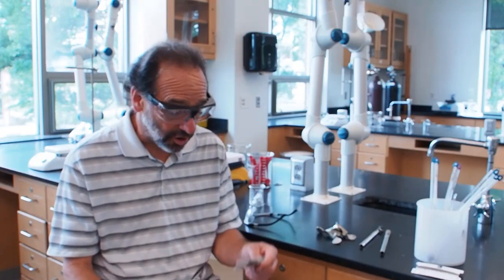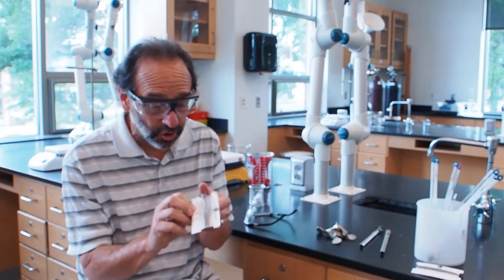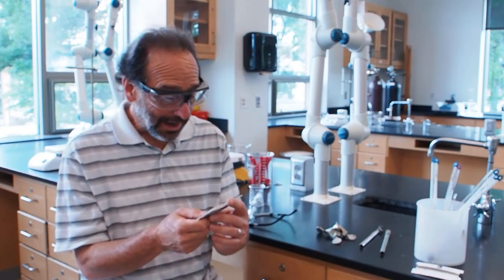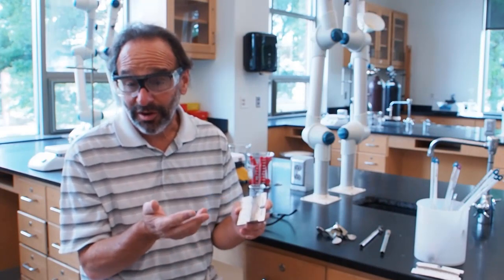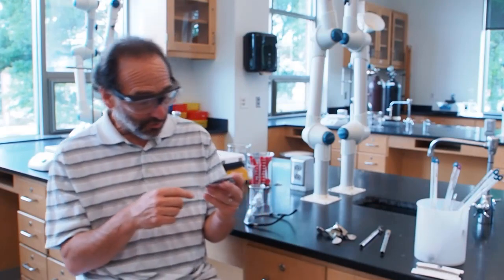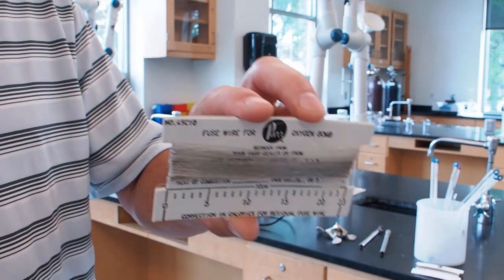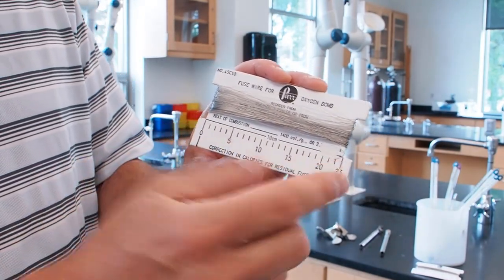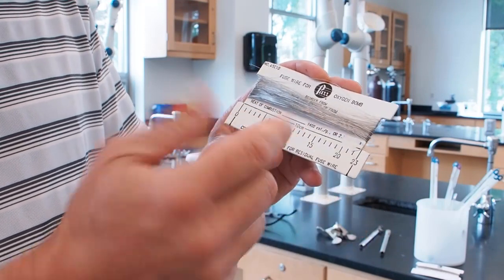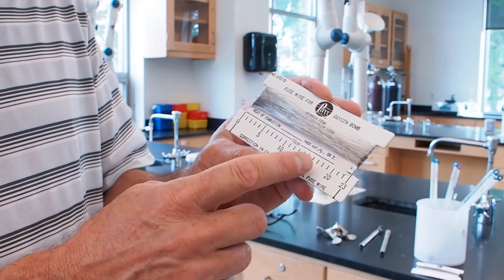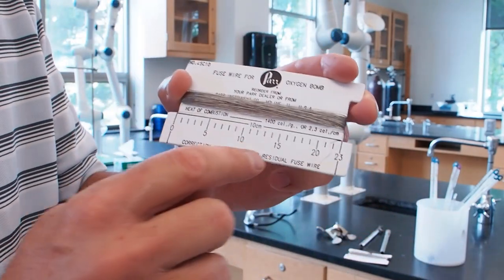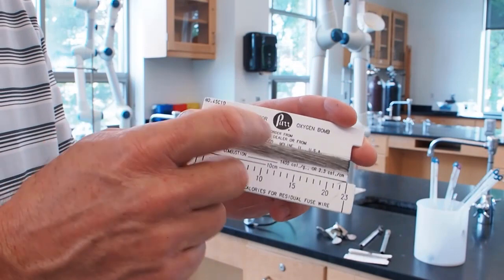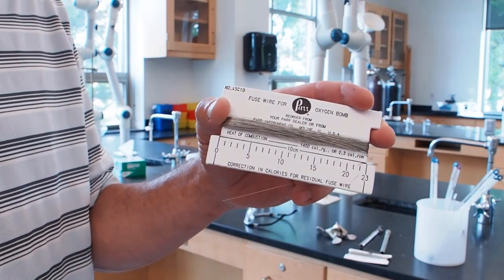The second thing is we're going to use some wire that burns. It's like a fuse. In fact, it's called fuse wire. That's going to ignite when we put an electric current through it and set the dog food burning. This is fuse wire sold by Parr, the makers of the bomb. And the wire itself is going to generate some heat, and we have to take that into account when we make our measurement. And in fact, this is really cool. The wire comes on a cardboard holder that gives you distances in centimeters. This is 10 centimeters long. It's 2.3 calories per centimeter of this wire that burns. So we're going to weigh the wire before and afterwards to know how much it contributes.